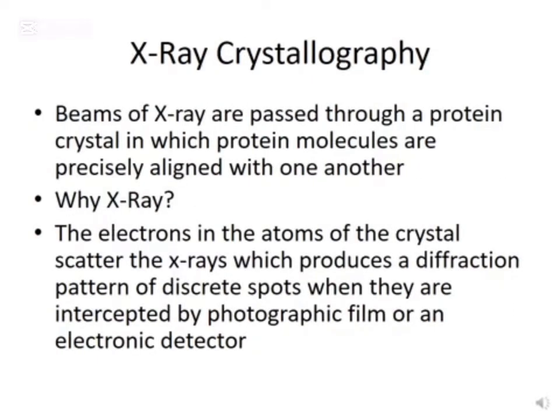X-ray crystallography is not used to decipher the polypeptide chain sequence. However, it's used to understand the 3D structure of the protein, so we know what the protein looks like, and as we have been repeating so many times, the structure of the protein dictates its function and would help us better understand how it accomplishes that function. So the most important part of X-ray crystallography is the ability to crystallize the protein, so to have it in a homogeneous construct that is stable, a 3D structure.